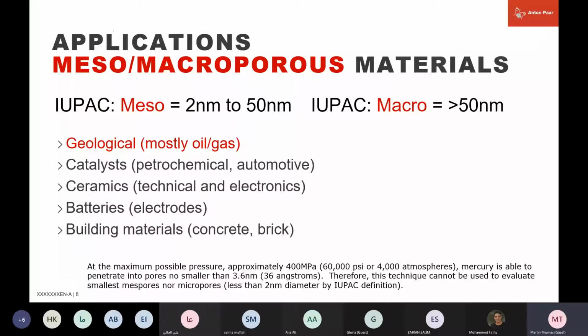So just to put it into context, the technique is not application specific. It's a very widely applied method and is applicable to basically all those materials that have pores within this range. And obviously today I'm going to look at core samples, so geological samples, mostly for oil and gas reservoir rocks, for example. But other geological systems might be of interest as well.